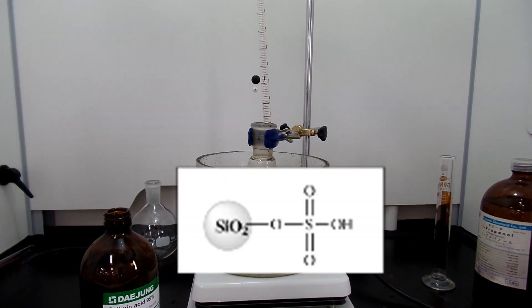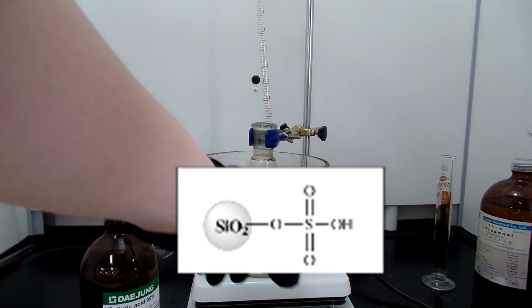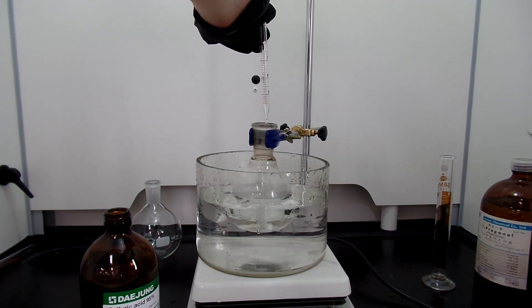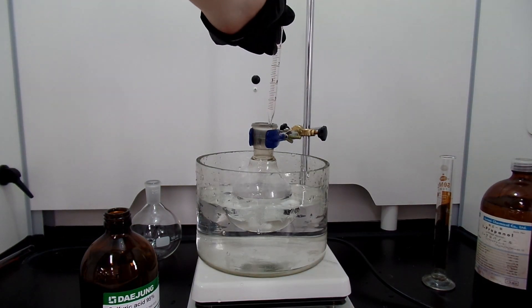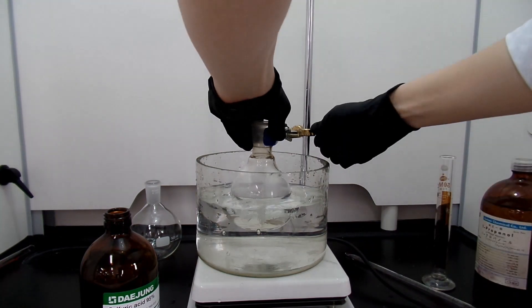Alternatively, you can use silica sulfuric acid, or SSA for short. Silica sulfuric acid is a solid acid and can be made by reacting sulfuric acid with silica and evaporating water at about 120–180 degrees Celsius. SSA is a solid acid, meaning that you can minimize the addition of water into the reaction, thus increasing the yield.